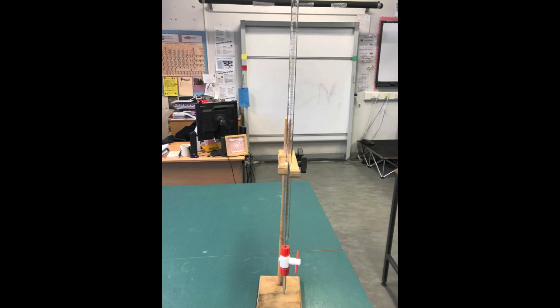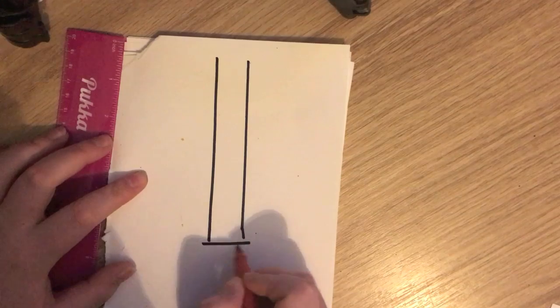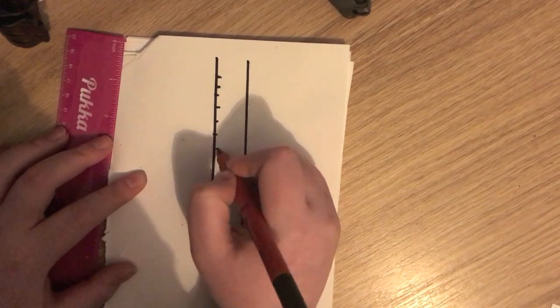A more accurate way of measuring liquids is to use a burette. These are used during titration reactions and have a very accurate scale and a tap at the bottom to allow liquid to flow.